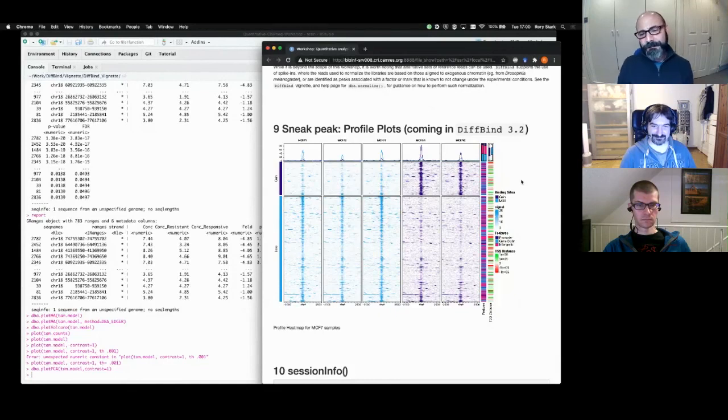So basically, I think the concept of DiffBind is... I remember having a discussion with Martin Morgan 9 years ago, and he was trying to understand what it does, because it's not a statistical method. It's a tool that wraps the very fine statistical work done in other packages. But the idea is it collects your experiment and lets you think about your experiment as an analyst and deploy all these tools in as straightforward and consistent a way as possible. And at some point, he suddenly went, "Oh, I get it. It doesn't do anything." And I said, "Yes, exactly. You nailed it."